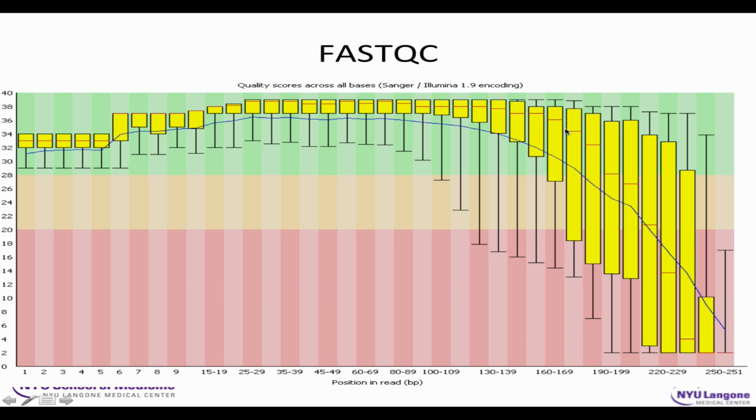There are tools that would allow you to trim away the low quality sequence so your reads become shorter, but they have fewer bad quality letters in them, which might improve the mapping to the reference genome, since bad quality bases might lead to a poor quality mapping or even prevent the read from mapping at all once it hits too many mismatches.